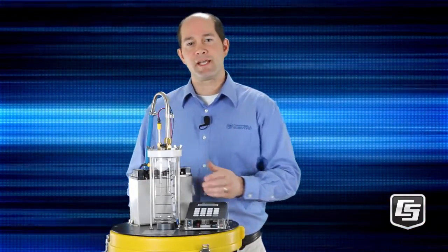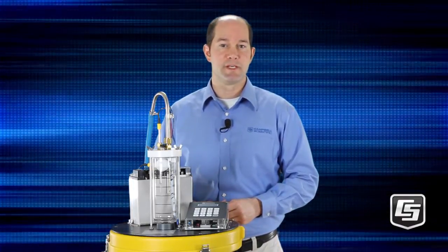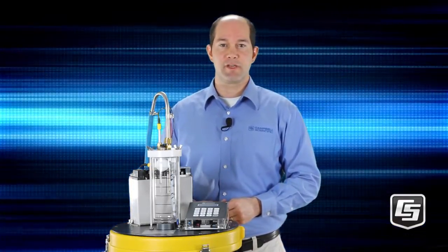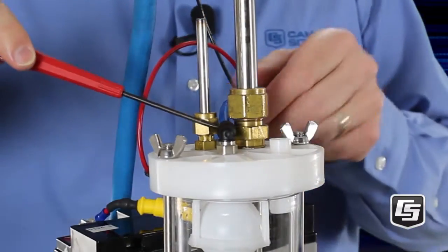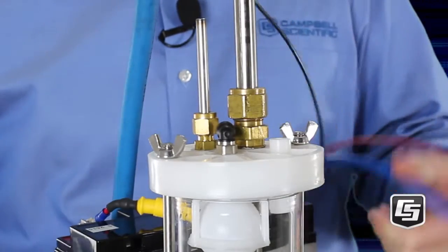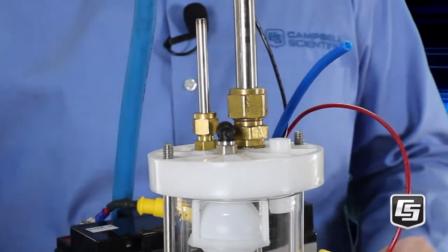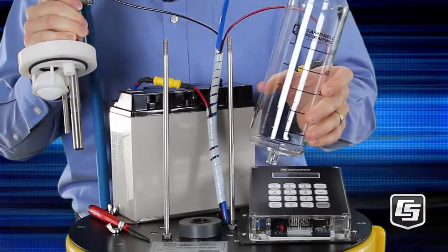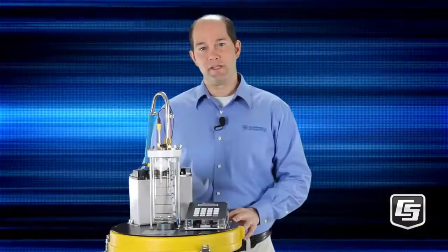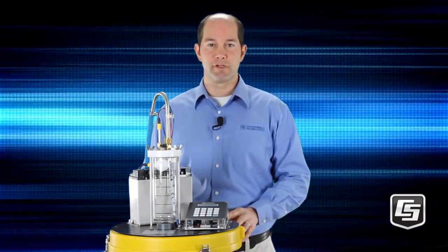This is the meter chamber, and that can get dirty over time. Instead of needing to replace it, you simply clean it — it's easy to maintain. To take it off, simply pull off the connectors and remove the two wing nuts. Pull off the top, and now you have access to the metering chamber. It's easy to remove, easy to clean, and easy to maintain. This will last a very long time without any replacement costs.